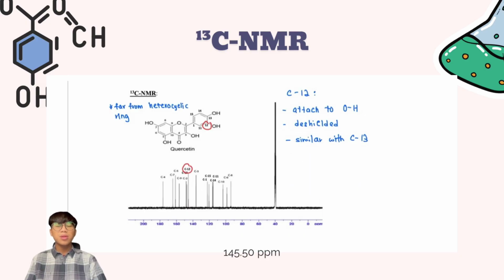Carbon number 12 is similar to carbon number 13, where it is directly attached to the hydroxyl group. The oxygen will de-shield the carbon, making it appear at a higher chemical shift, which is 145.5 ppm, meaning it is de-shielded.